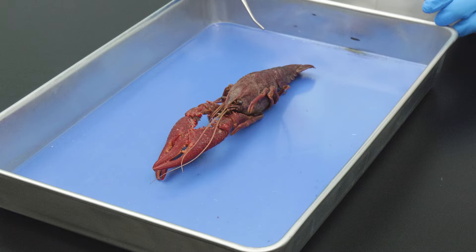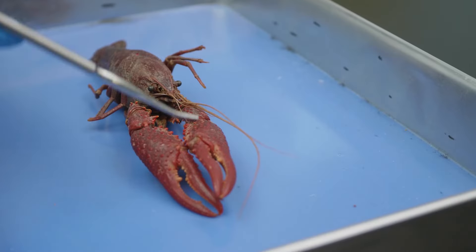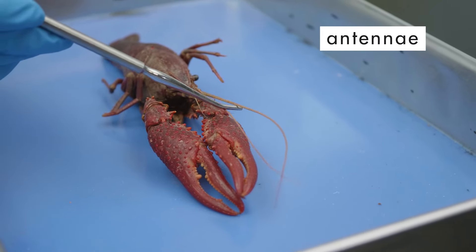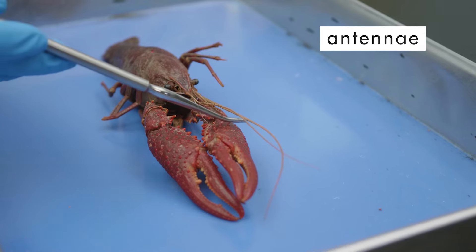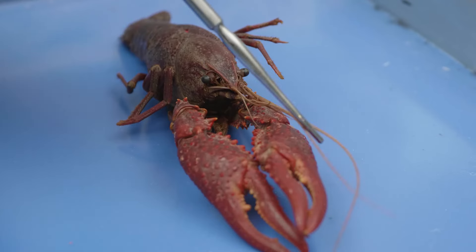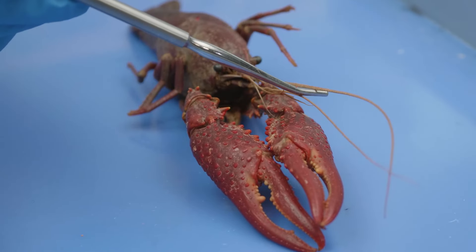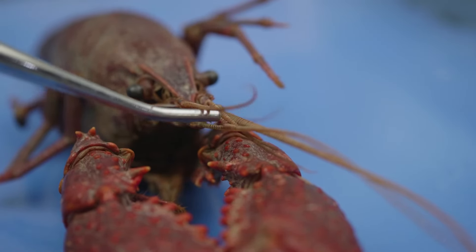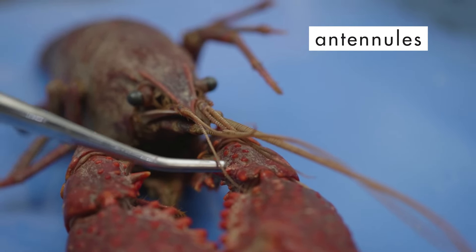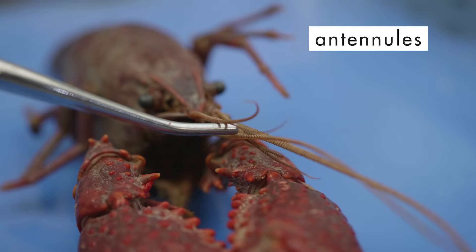Like all arthropods, a crayfish has jointed appendages. At the anterior end are two or three pairs of jointed appendages called antennae, which are sensory organs for the crayfish's senses of touch and smell. One pair of antennae is long, but crayfish also have one or more pairs of shorter antennae called antennules. This particular species has two pairs of antennules.